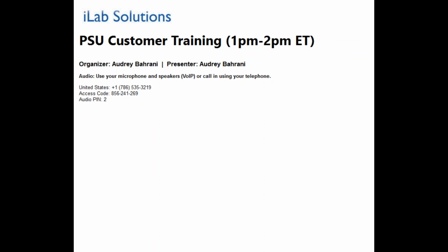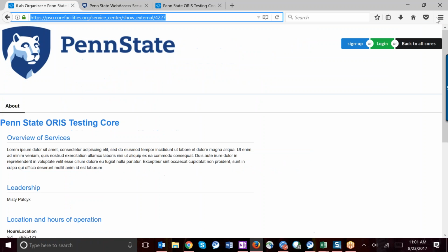So I'm going to go ahead and start sharing my screen with you. Are you able to see it? Not yet. Oh, there it is. All right, okay, perfect. Excellent.